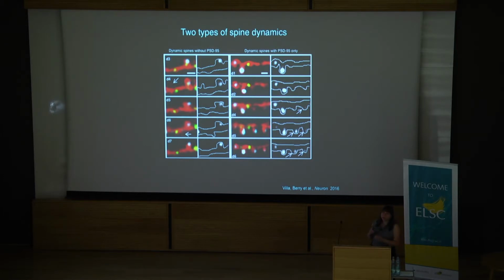So this is what those dynamics of the spines without PSD95 look like. And so most of the dynamics are of this type of the spines.